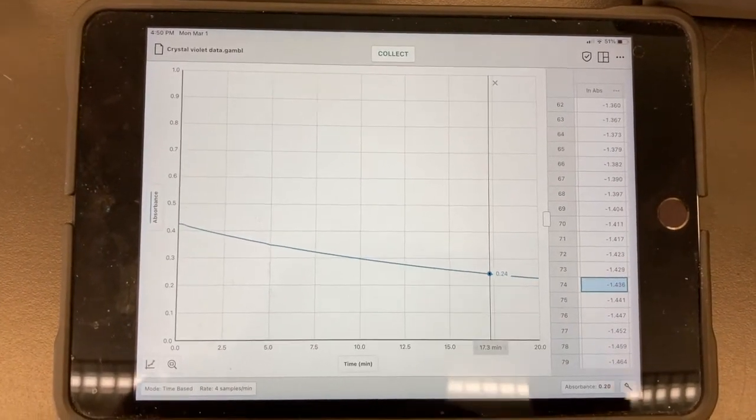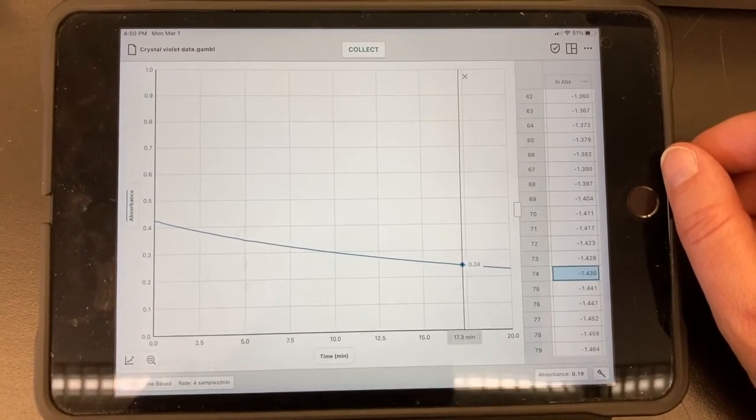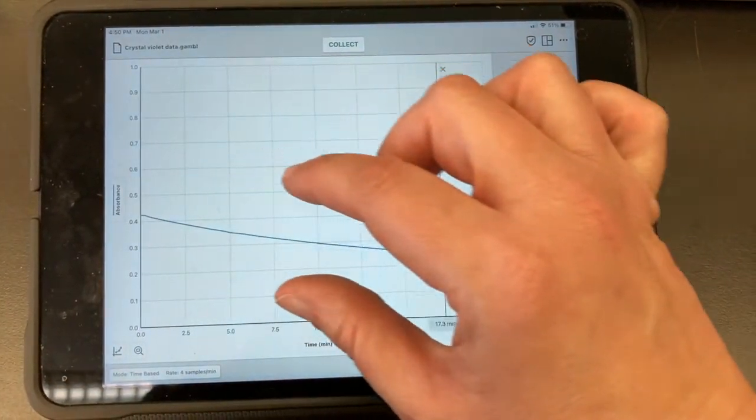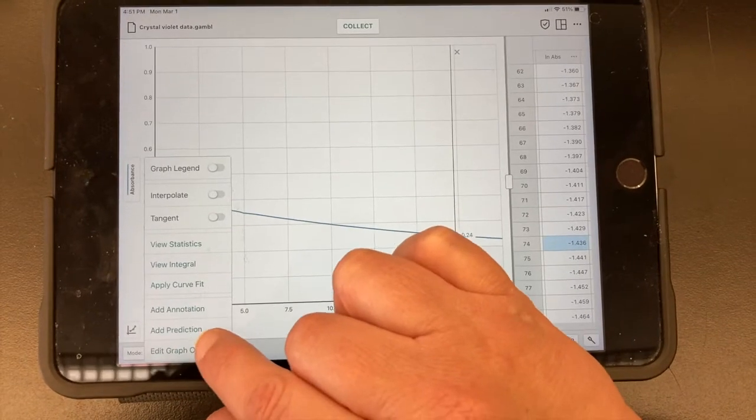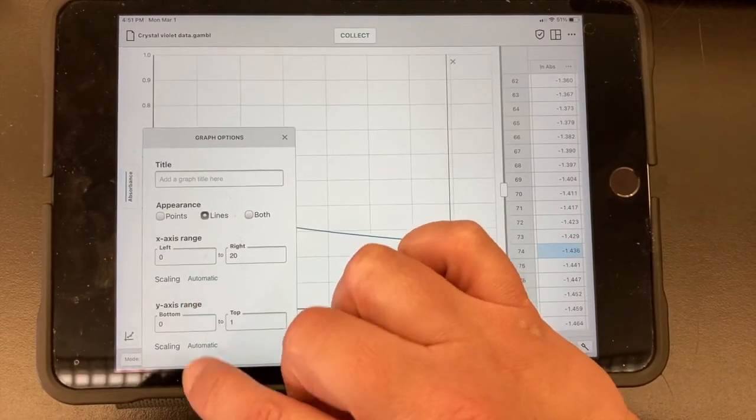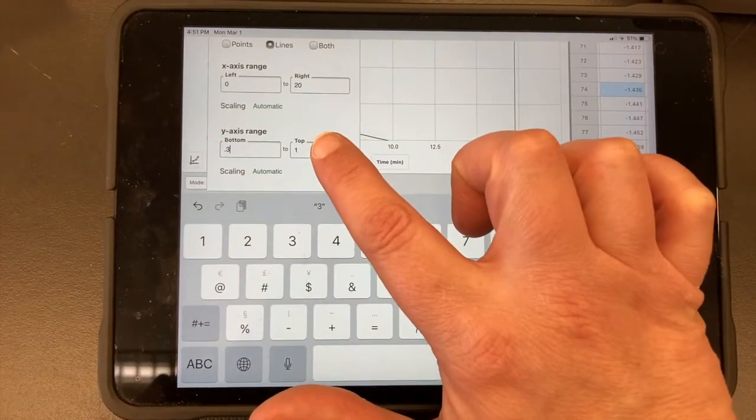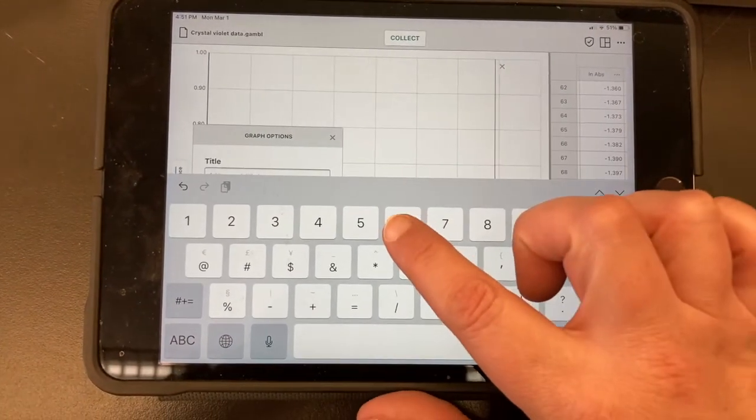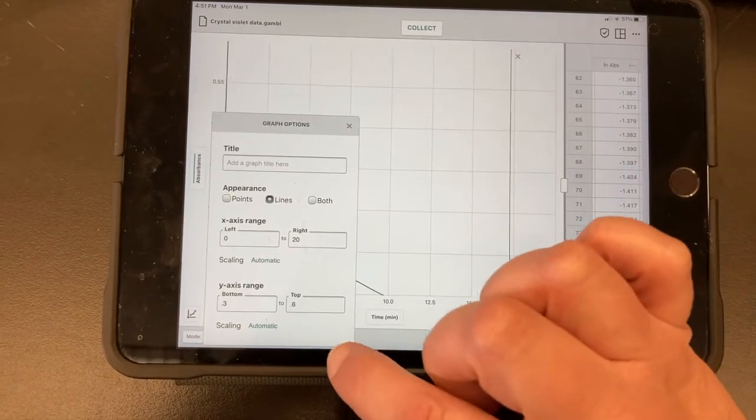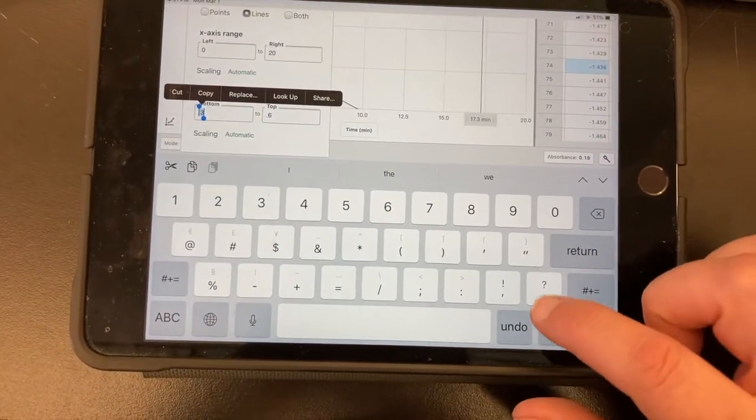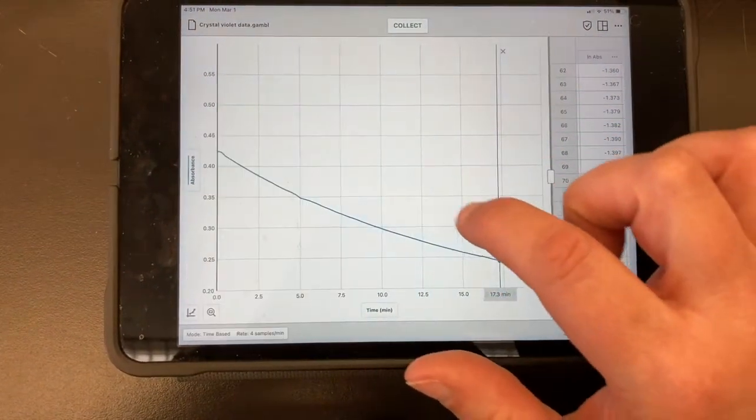Now we are going to look at the graph. We want to see which of these graphs is the most linear. Now this might look a little bit linear to you. It might look a little bit curved. One way we can help to see that by looking at it is by narrowing down our range to on the y-axis to just the area that we are using. So remember you can go to the edit graph options. And we can decide that instead of doing zero, we are going to do 0.3. And instead of 1, we are going to do 0.6. And that will spread out our data a little bit. It looks like we need a little bit lower than 0.3, so let me make that 0.2.